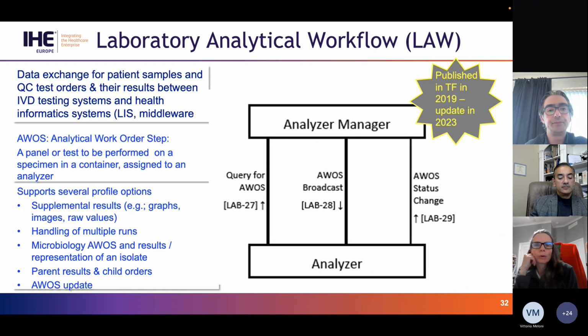So the laboratory analytical workflow goes between the analyzer manager and the analyzer. This is the IVD test instrument that is actually performing the testing, and it supports two ways of dealing with it. The analyzer manager can send out all the analytical work order steps, or AWOSs, to the analyzer. And so it's a push order from the analyzer manager to the analyzer, but it also supports the situation similar to on the DPIA side, where a slide would show up at the scanner.